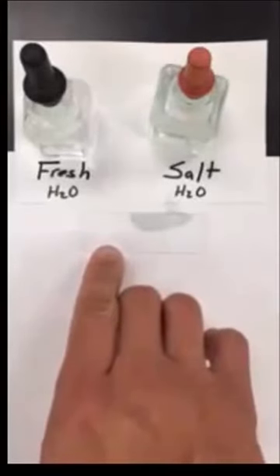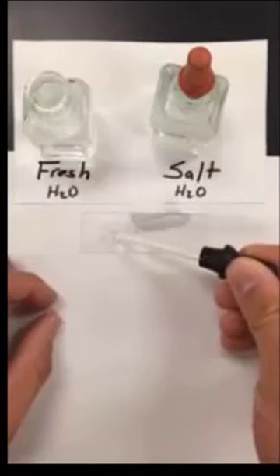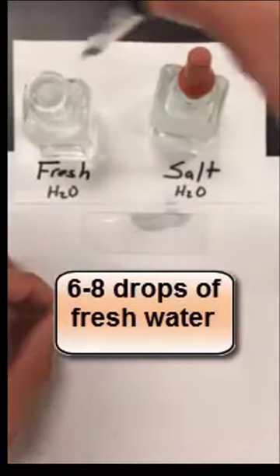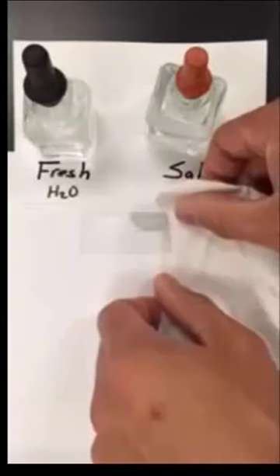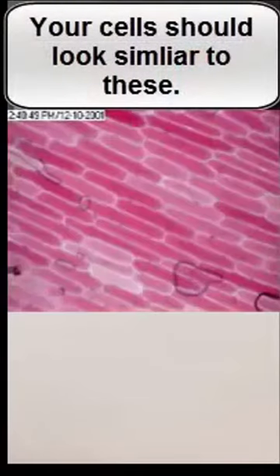Now that you've finished steps seven through ten, we're up to step twelve. Step twelve is very similar to step seven, but this time we're going back to fresh water instead of salt. Place a few drops of fresh water to the left of your cover slip, then take your paper towel and draw the water across again. Your fresh water will now flood the red onion skin and replace the salt water. Keep doing that until most of the fresh water on the left has moved under the cover slip, and then you're ready to finish up your lab. That's how you set up your wet mount slide and draw solutions underneath the cover slip.